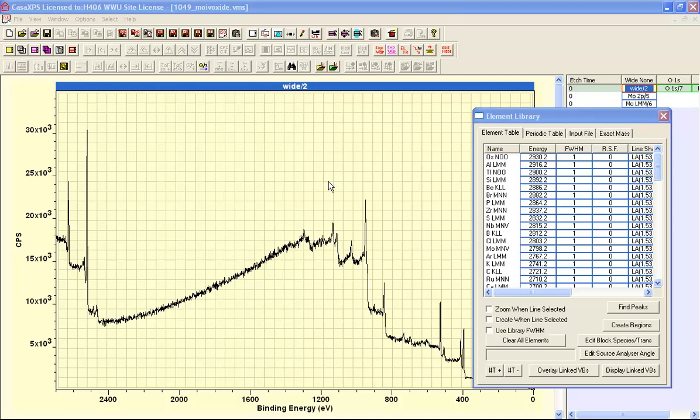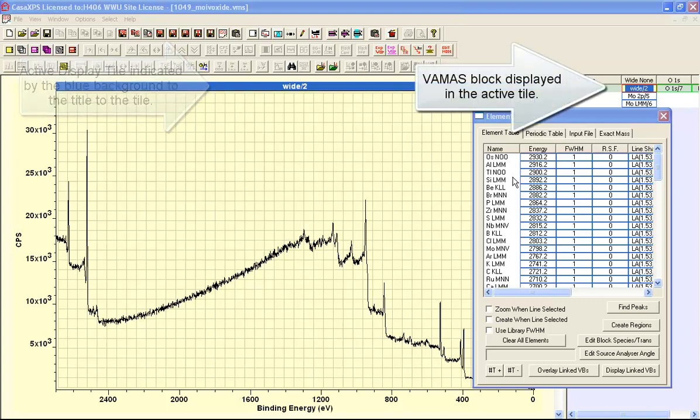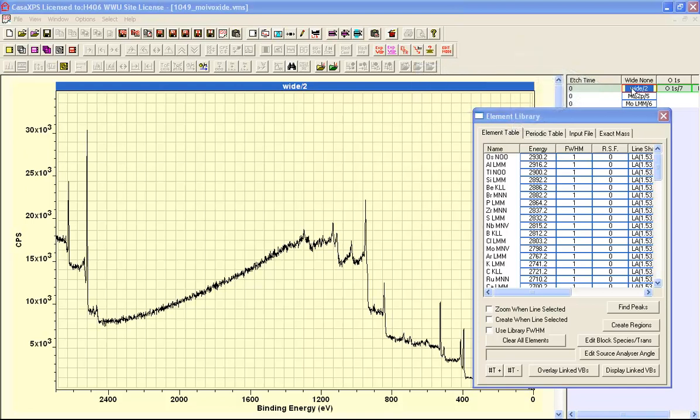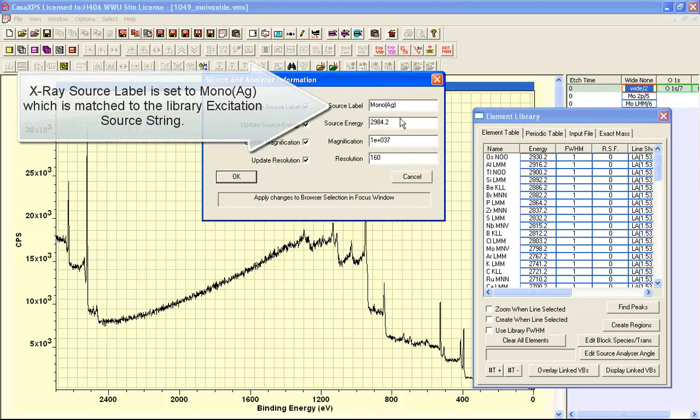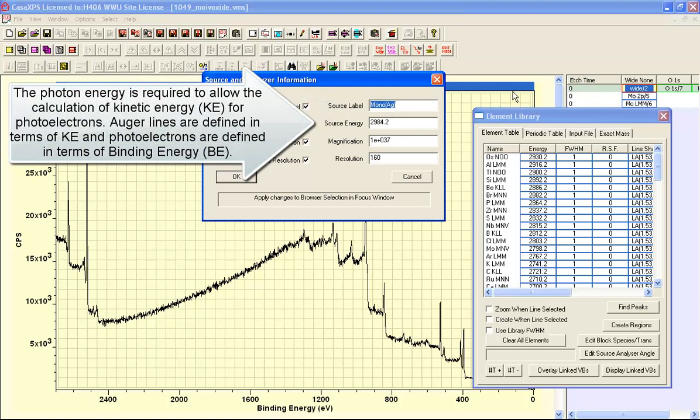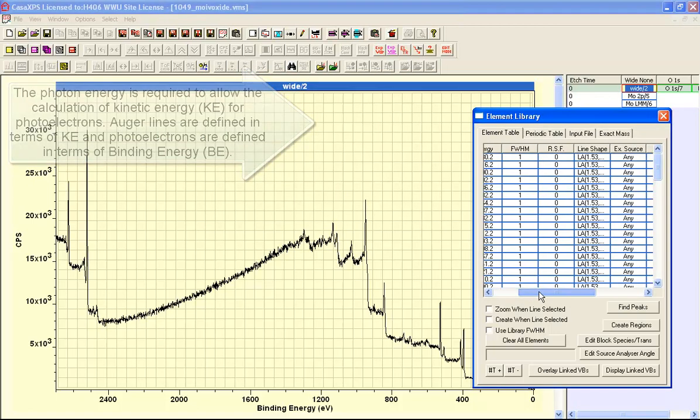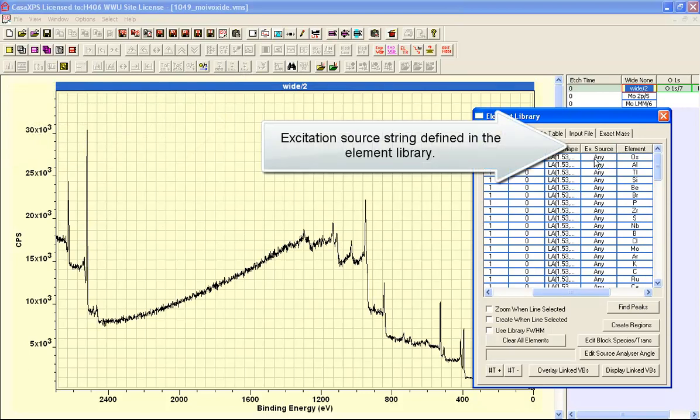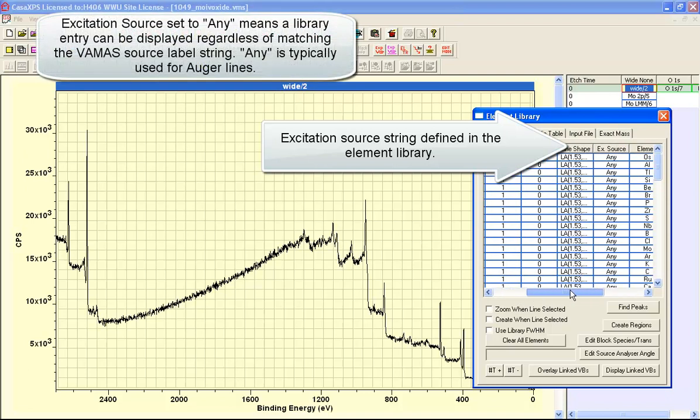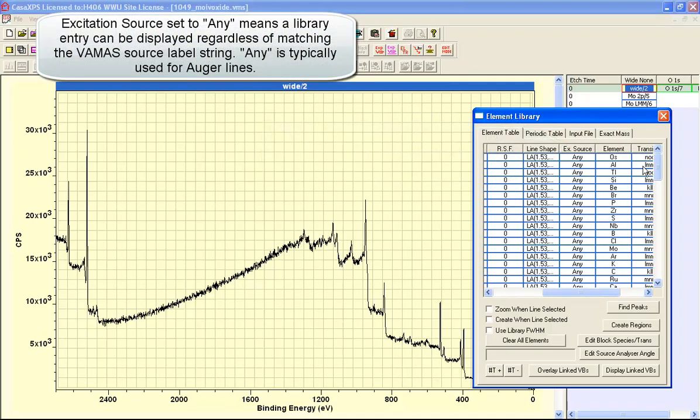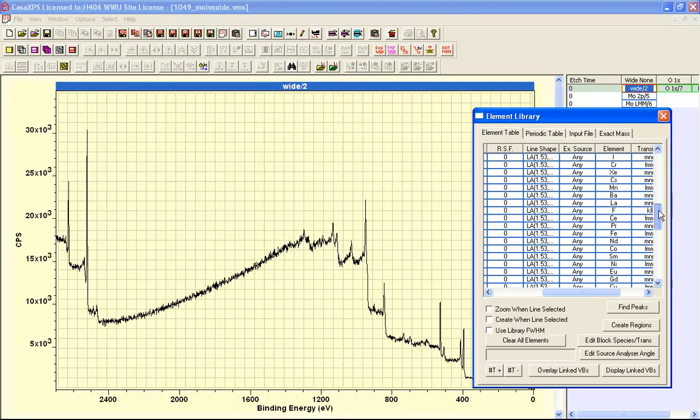When a spectrum is displayed in the active tile the element library displays element transition fields based on the X-ray source, the X-ray source label that is associated with the data and the VAMAS block from which the data is displayed. If we look at the VAMAS block information the silver anode is indicated by the source label and the element library will display transitions that match either the string that says any, these Auger lines, or fields that have the silver mono source label.